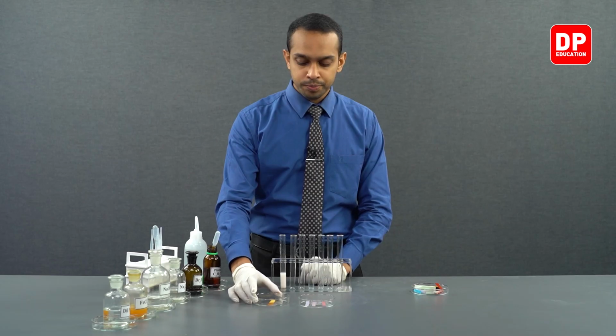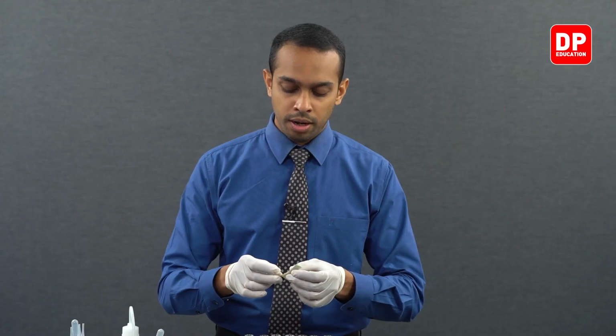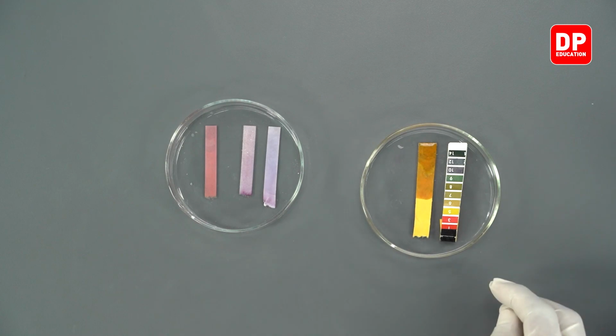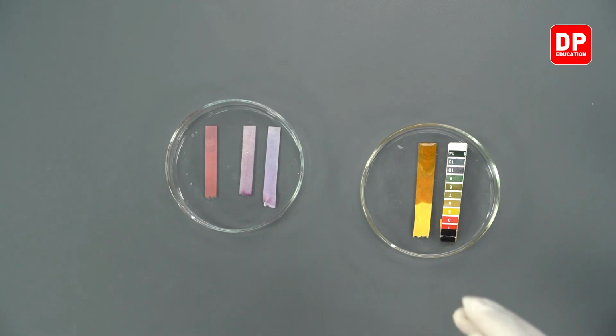As you can see, when we added a small amount of phenol solution into our pH paper, the color that the pH paper turns to is somewhere between yellow and red.